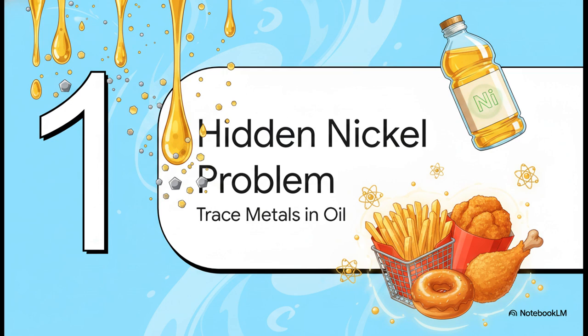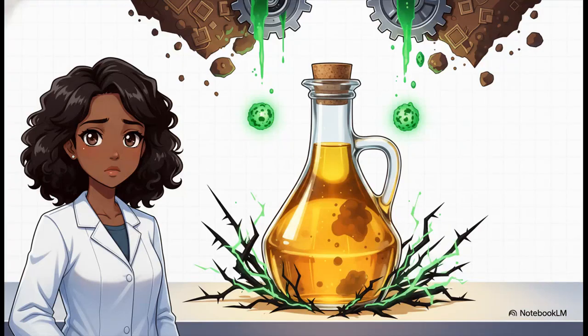Section 1. The hidden nickel problem. Let's establish the scene of the crime. So nickel isn't just some minor nuisance that degrades nutrients and ruins the shelf life of your cooking oil. It is a serious, quantifiable biological hazard. Trace nickel can actually sneak into our oils from a bunch of places: the soil the crops grew in, agricultural fertilizers, or even the heavy industrial machinery used during the pressing and production process.